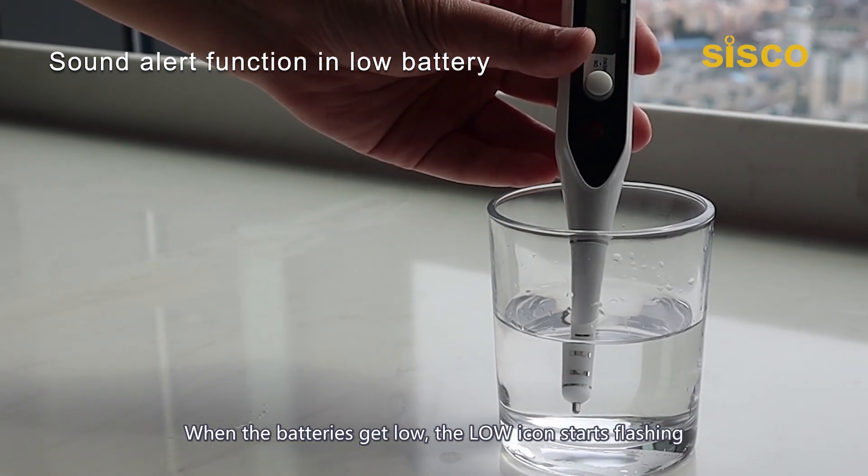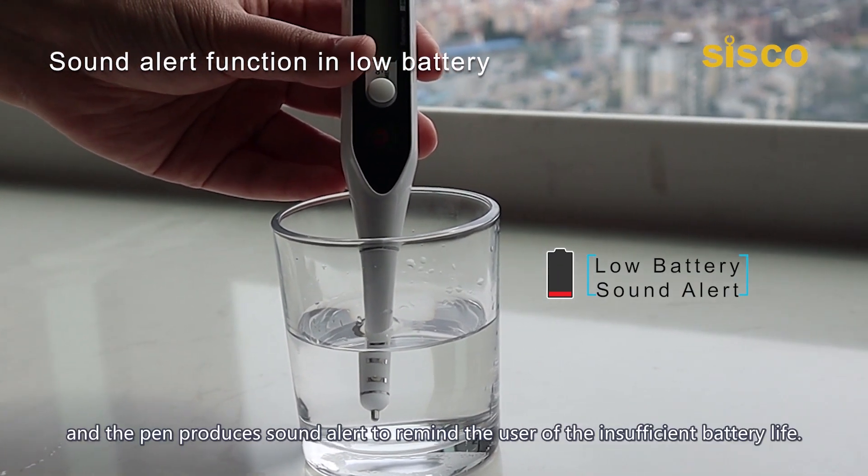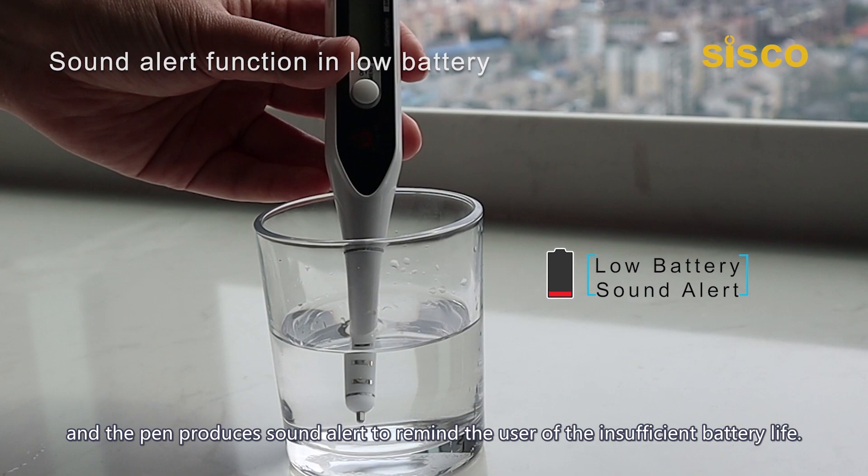When the batteries get low, the low icon starts flashing and the pen produces a sound alert to remind the user of insufficient battery life.